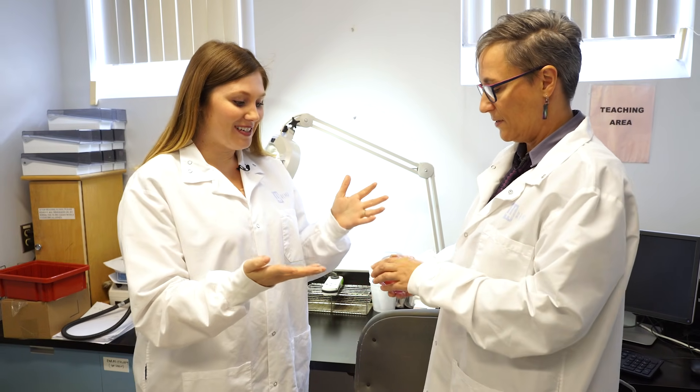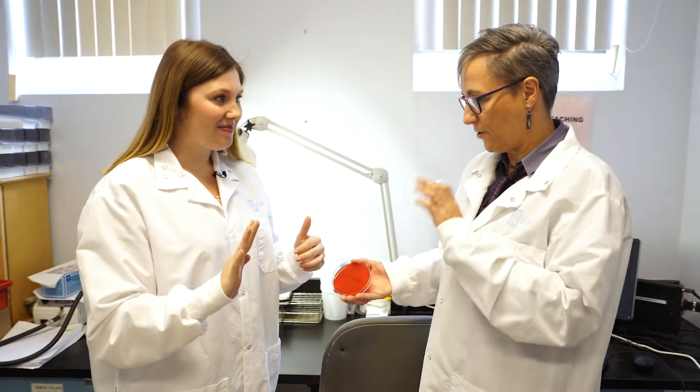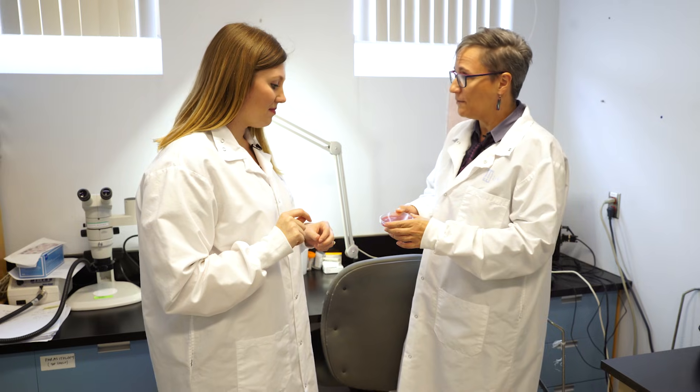I've touched stuff like doorknobs and handles — things I might encounter in everyday life. This plate has agar which will allow the bacteria to grow. Take your three fingers and press them onto the plate, just enough to make a little dent. Then this will go into an incubator overnight and we'll see what grows.